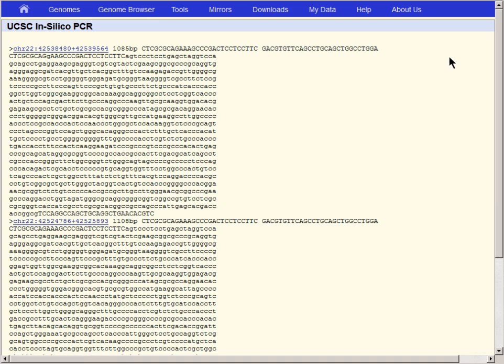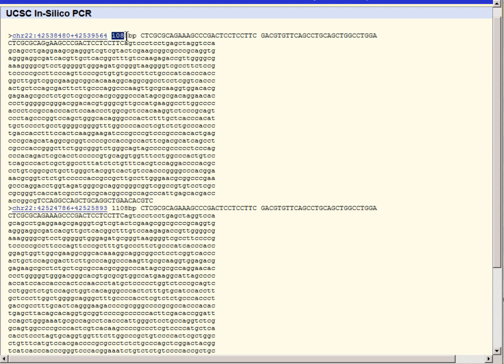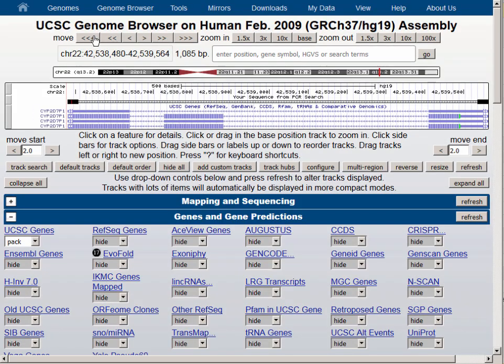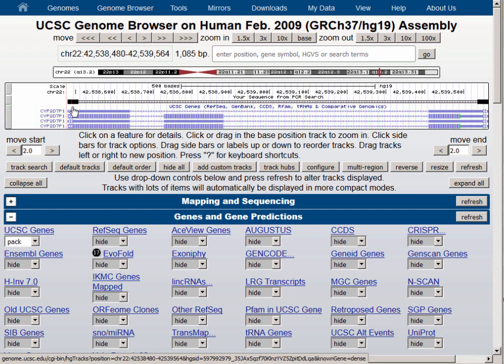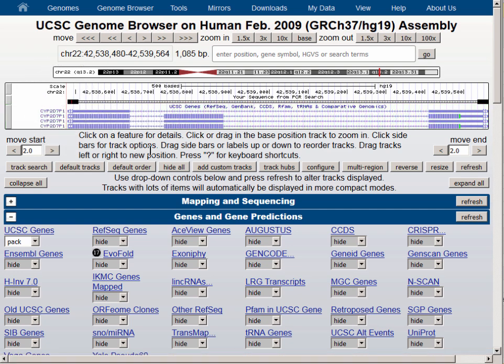You'll notice in the results that we actually have two amplicons predicted by the tool. One of them is 1085 and the other is 1108 base pairs. Let's click into the top one, the 1085 base pair amplicon, and we'll notice that we are on the genome on chromosome 22, but we are at CYP2D7P1, a pseudogene that apparently closely resembles the 2D6 gene where we got our primers. In fact, you'll notice that there's a one base pair mismatch annotated here by a red tick mark near the left end of this annotation.